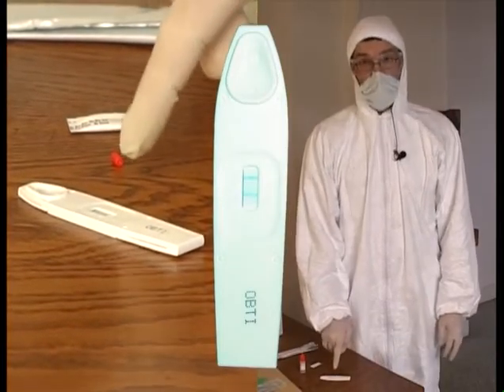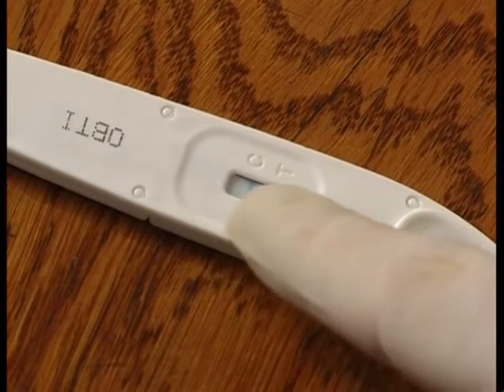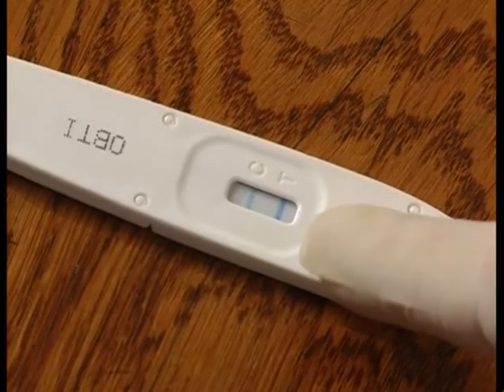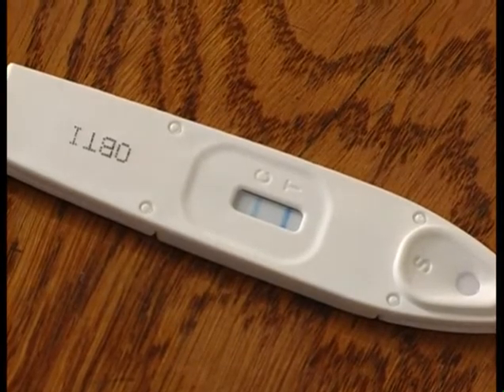It will pass in front of a window where a C and a T are marked. You can see the bar that appears before the C — marked CTRL — which means the test worked correctly. But it is the bar in front of the T which is most interesting, because it confirms that the sample we took is actually human or primate blood.